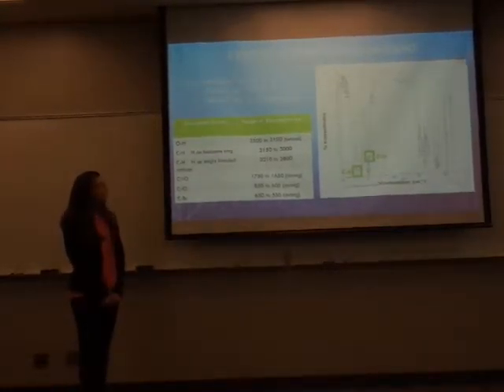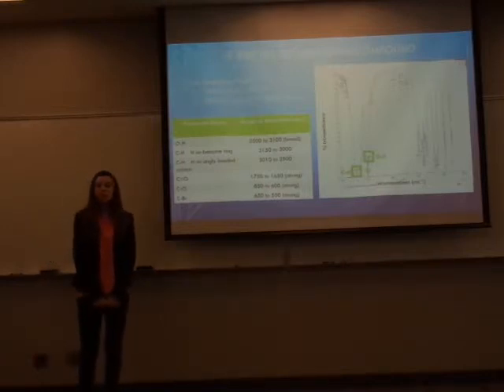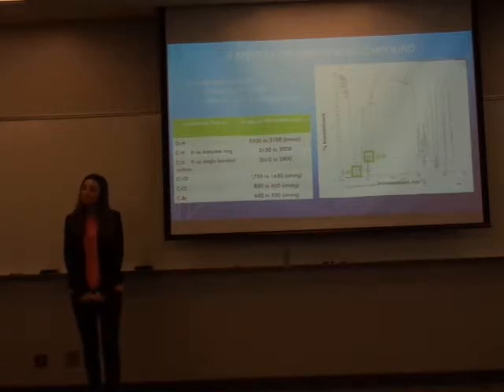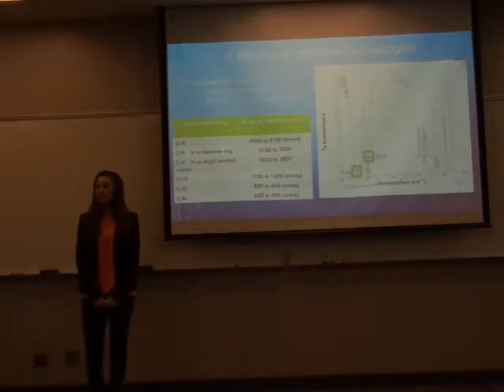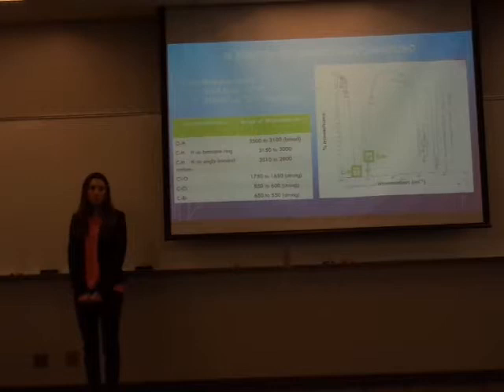From the spectra, we see that there are 2 absorption peaks from the unknown compound. The first has a value of 3,368.62 inverse centimeters, which corresponds with the OH functional group. The second is 2,884.91 inverse centimeters, which corresponds to the C-H single bonded functional group.